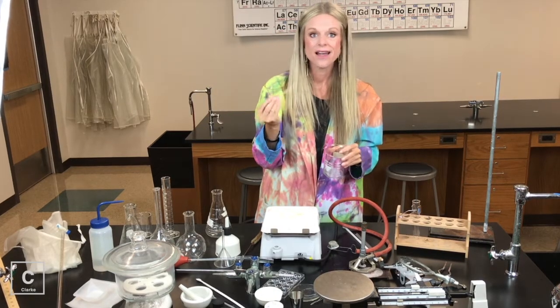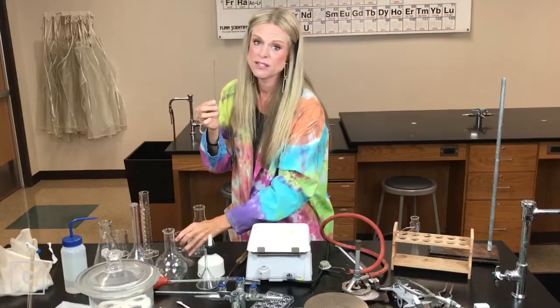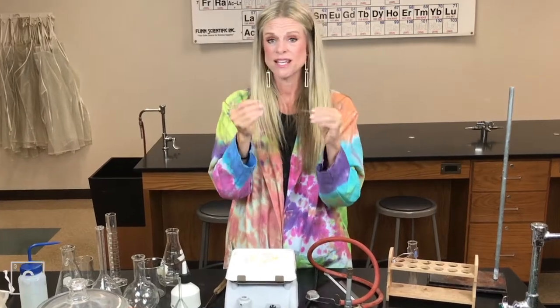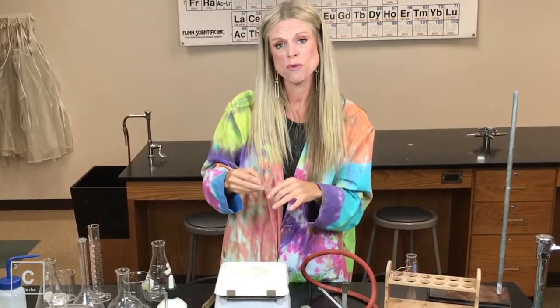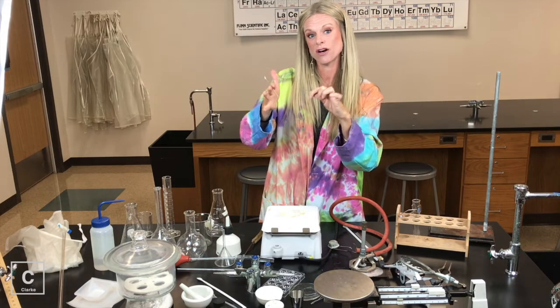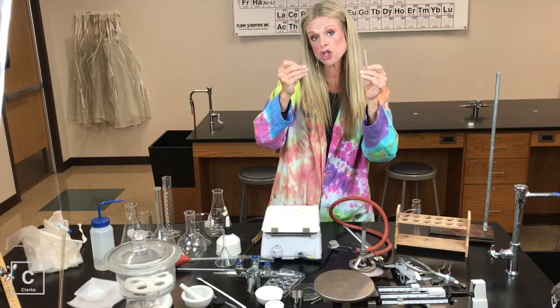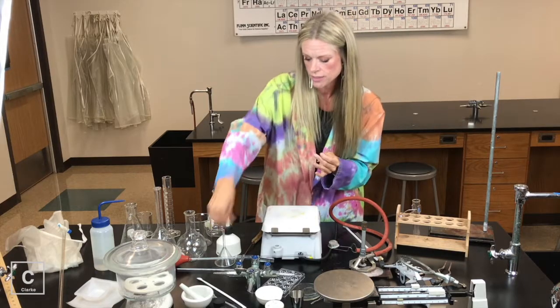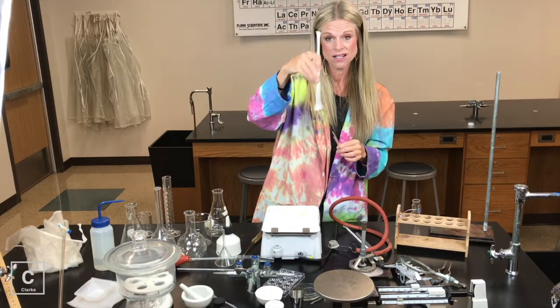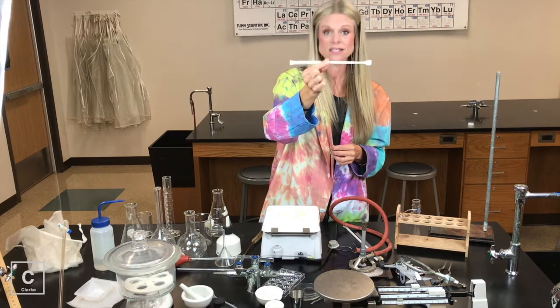The problem is, as a chemistry teacher, I would say this is the most dangerous thing in my lab. This has been the thing that's been broken the most. It is also the thing that has caused the most bleeding and the most injuries, because this thing is so fragile. You're stirring it, you put too much pressure on it, and it snaps — a lot of times when it snaps, it jams itself right into your hand. I'm starting to slowly replace these glass stirring rods with plastic stirring rods. They even have this little flat end, which kind of helps.